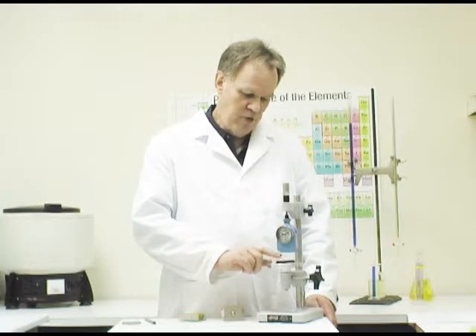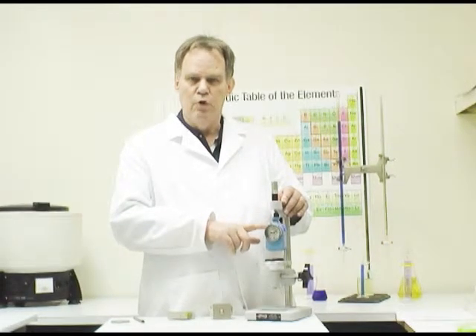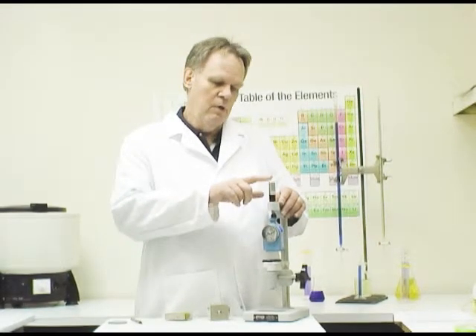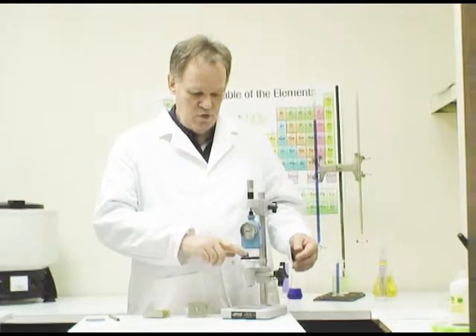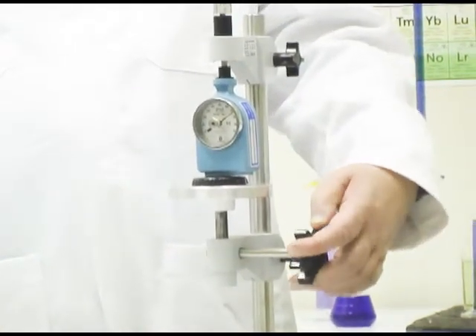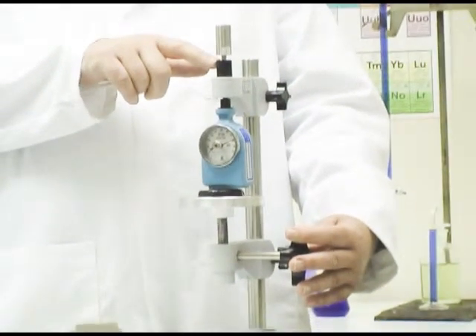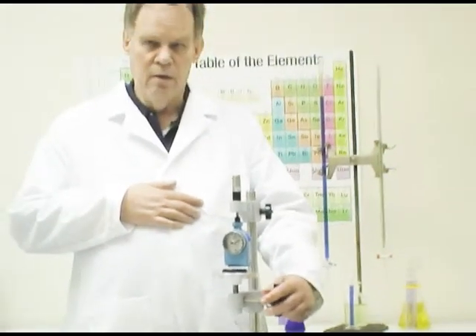We'll now measure the hardness of a hard epoxy polymer in the Shore D range. I've mounted the Shore D durometer on a durometer stand, which applies a constant force to the test sample so you know the needle is pushed in with the proper amount of force. There's a weight on top for either a D or A durometer — I have it set for D. You place the sample down, center it on the needle, use the handle to raise the base, and when the weight comes off its rest, you get a reading on the durometer scale — in this case, 85. It's common to check several points on your sample, getting four, five, or six measurements.